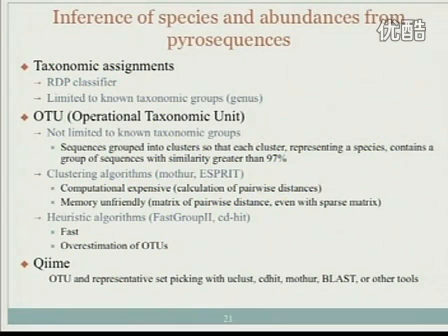They will use heuristic methods like CD-HIT. You just randomly pick one as the representative sequence and group the others to that one as long as they are similar. So it's not really a rigorous clustering algorithm, but it works a lot faster. But if you use those heuristic methods, you will overestimate the OTUs. If there's nothing else you can do, you probably have to live with that.